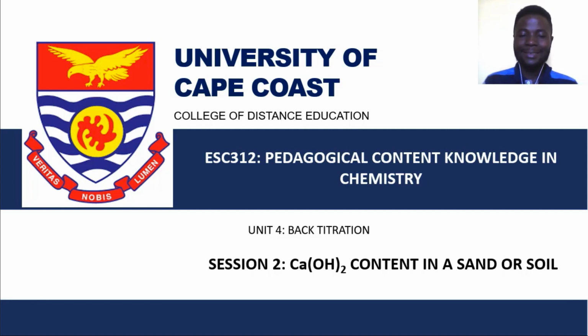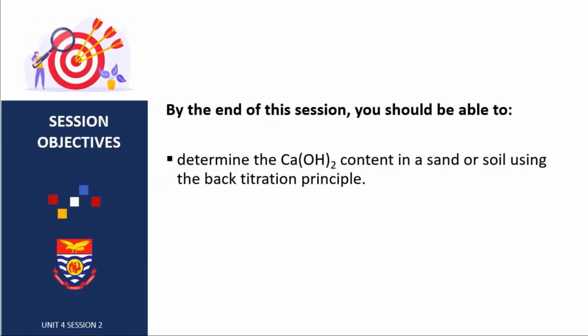In this session, we are going to determine the calcium hydroxide content in a sand or soil. Let's proceed to look at our objective. By the end of this session, you should be able to determine the calcium hydroxide content in a sand or soil using the back titration principle.